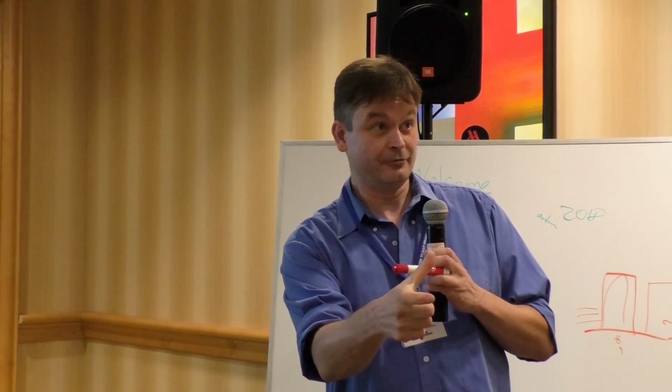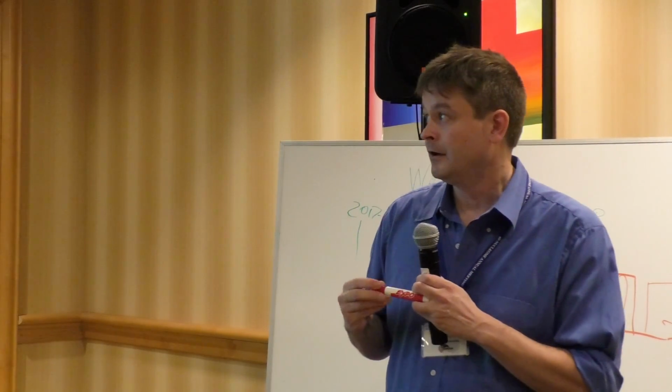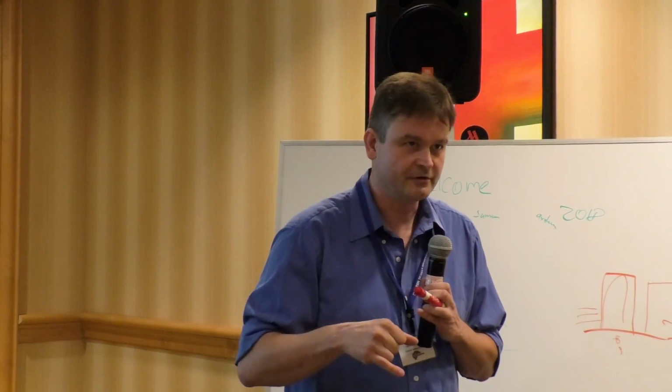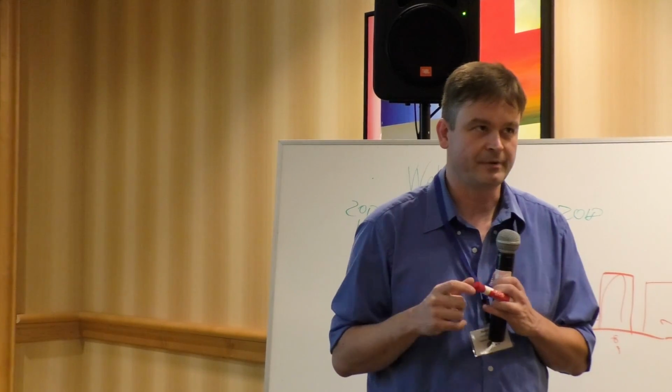Once you start saying, well, I want to count the 3D distance between two spots, or, well, I know they're in 3D, I just count them in 2D because I Z project, because 3D data processing is really beyond what I can do here right now. But if you start doing these sorts of analysis, it's time to document what you did and how you did it and how well it was done so that we can compare it.